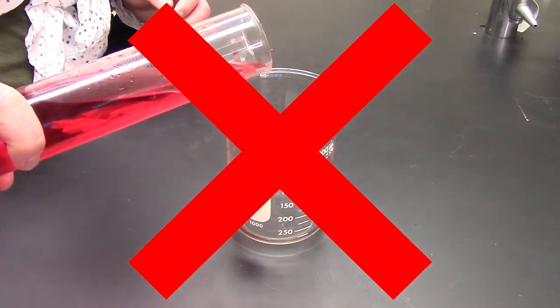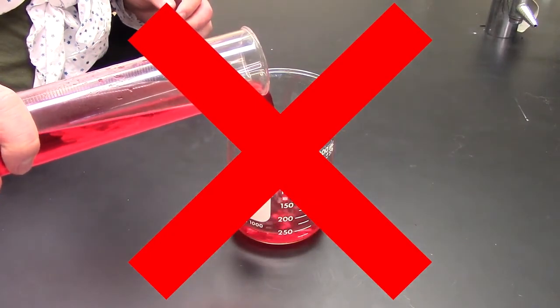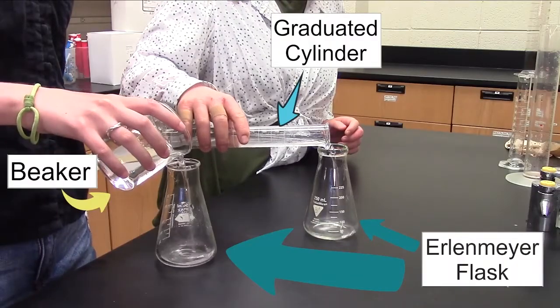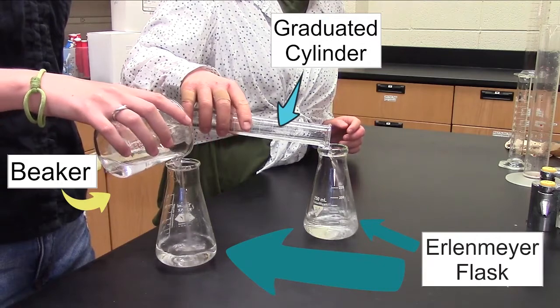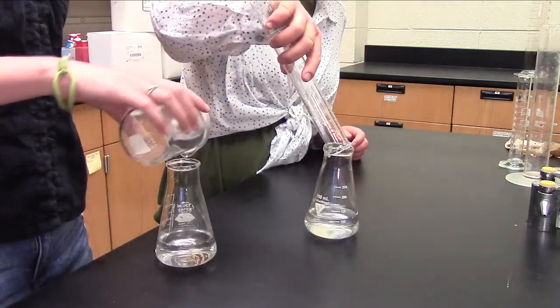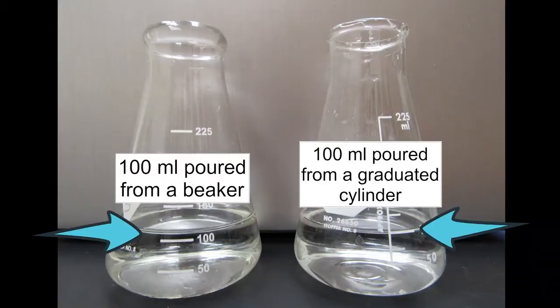Never measure liquid in a beaker. It isn't meant to be used like that and is only good for mixing solutions. Beakers have lines on the side to show the approximate volume of the container, but in comparison to a graduated cylinder, a graduated cylinder is much more precise at measuring a specific volume than a beaker.